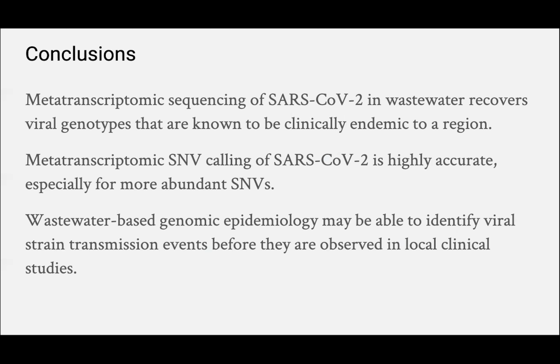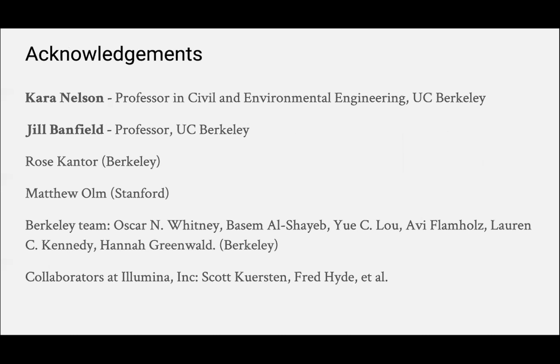And so that's really, I think, the long-term goals and big picture prospects for wastewater-based genomic epidemiology. Can we detect, not only can we detect virus, not only can we identify how much, say with qPCR, but can we understand what are the strains in an area, where have they come from, and is it one or many viral genotypes? And I think we were able to see hints that we were able to start doing that sort of thing in this data set.